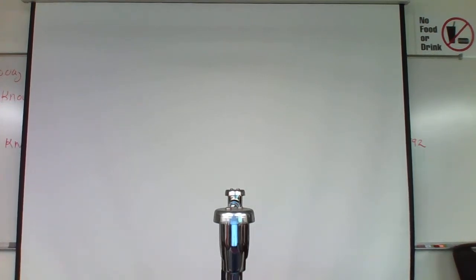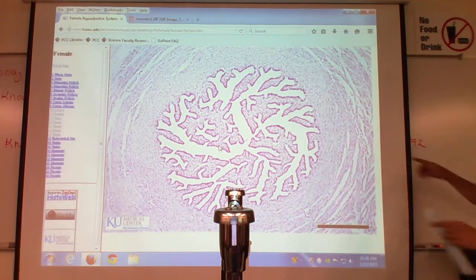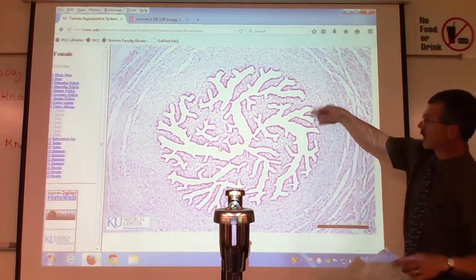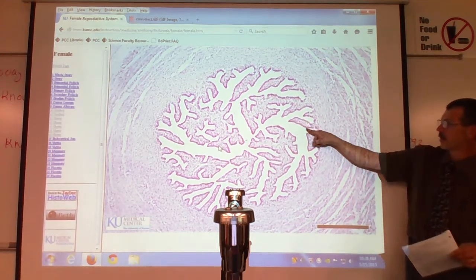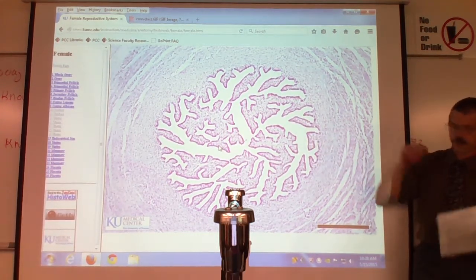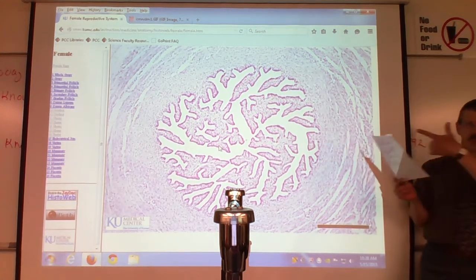Ooh, I don't have a close up, do I? You have to trust me, there's cilia in there. I think you can kind of vaguely make them out. But there's cilia that move your eggs along. So it's like the dark, like, yes, that's the outer edge of the snowflake, to move eggs along. So hint, this is not a vas deferens.